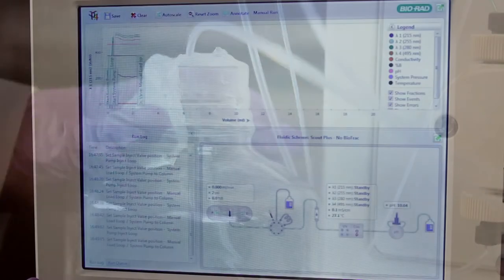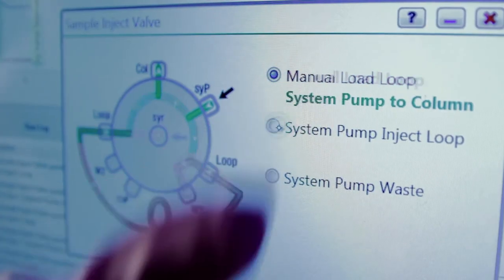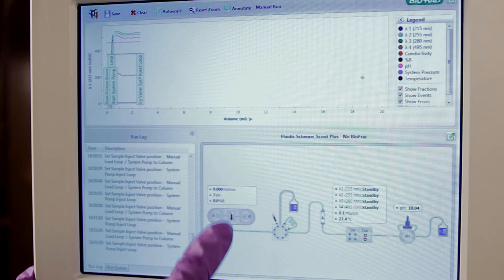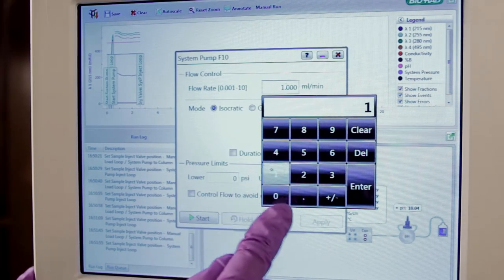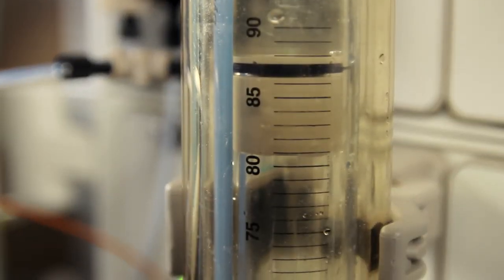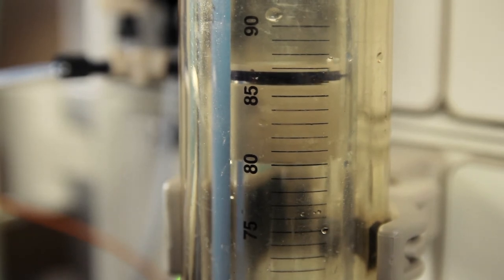Next, prime the Dyna Loop by selecting System Pump Inject Loop on the touchscreen. Use the Pump Maximum Flow Rate to fill the Dyna Loop and purge air from the system. The sliding seal will travel from the maximum volume to 0 mils as air bubbles are forced from the system.